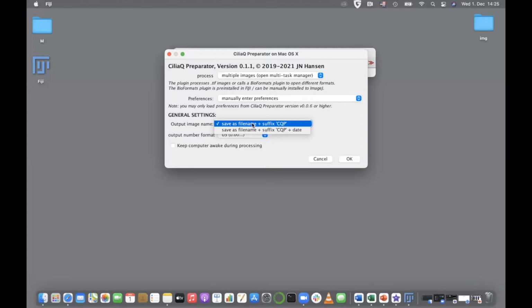differ in terms of the name, and you have to be careful when analyzing your images if you want to analyze an image maybe with different options more than once.